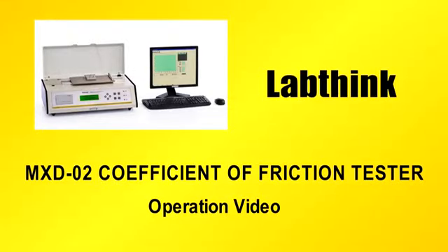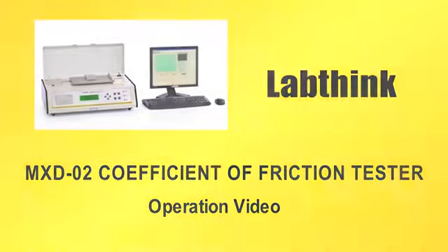MXD-02 coefficient of friction tester. Operation video.